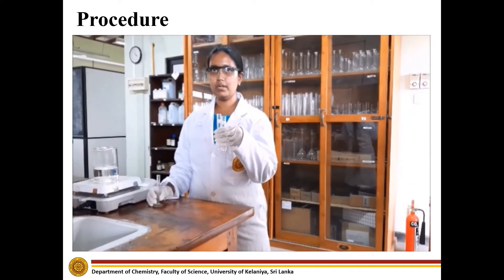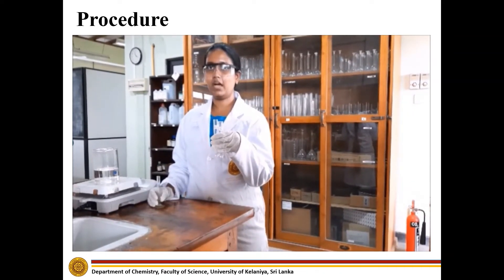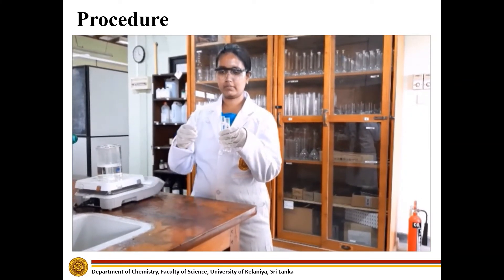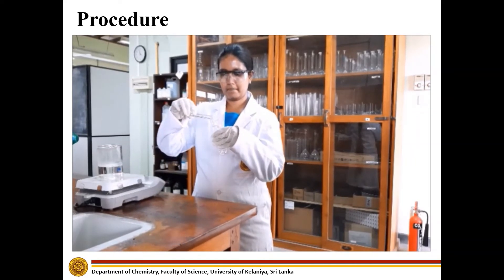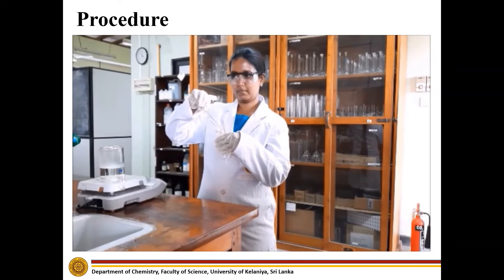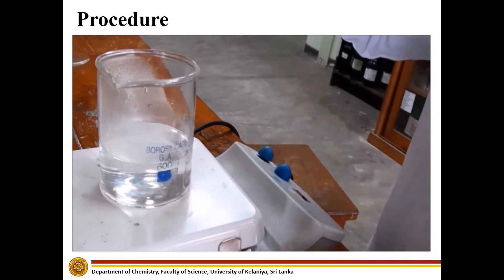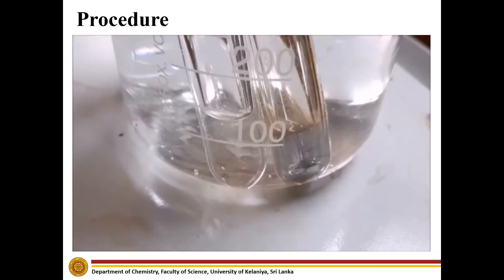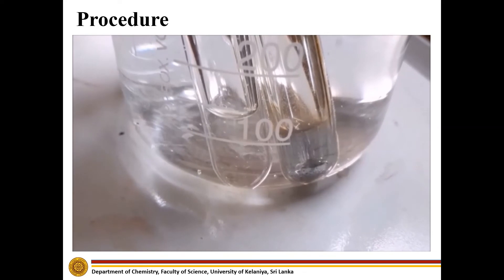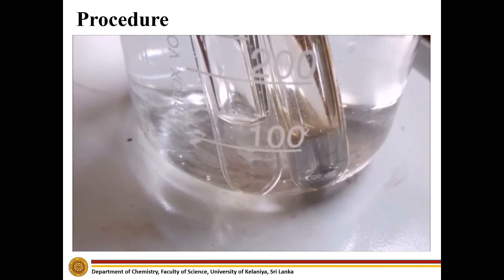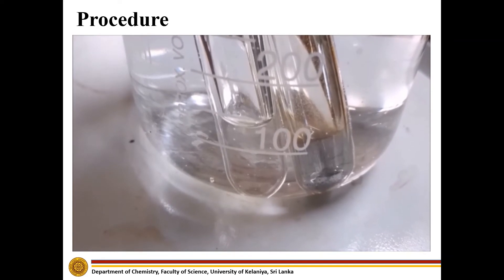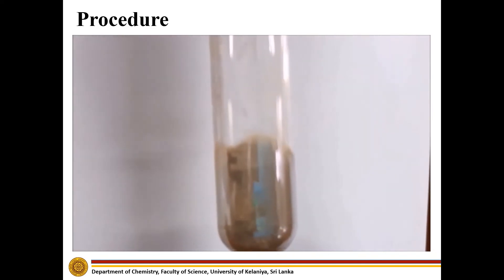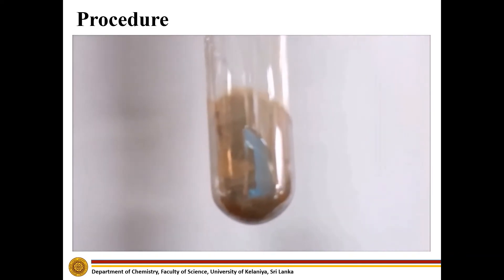Add freshly prepared Tollens' reagent into acetaldehyde and acetone and boil them for not more than 5 minutes. Here you can see a silver mirror is developing in the test tube that contains acetaldehyde, but you cannot see a silver mirror in the test tube that contained acetone. Here you can clearly see a silver mirror deposited on the wall of the test tube.